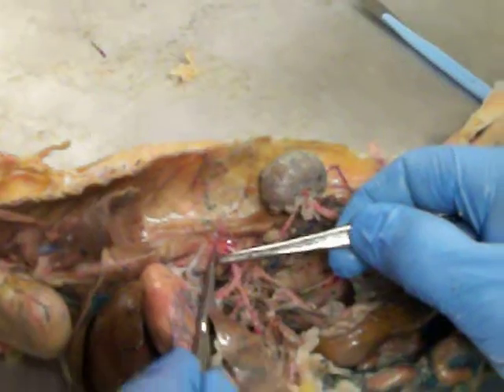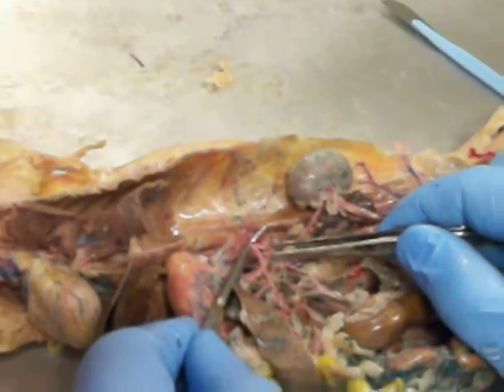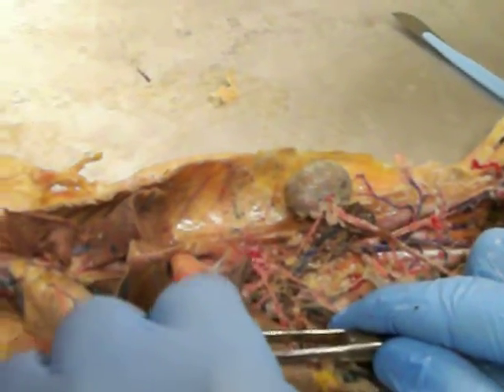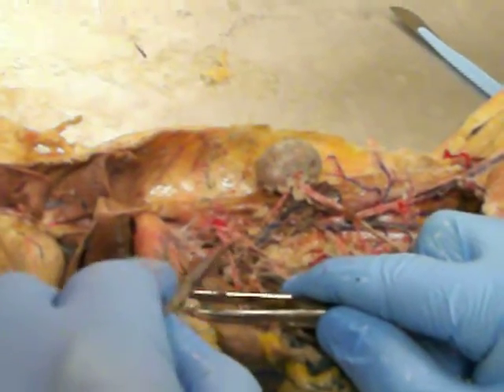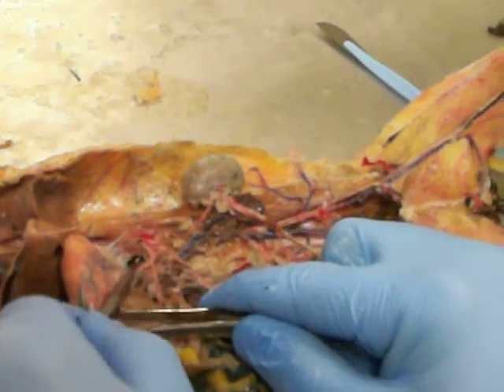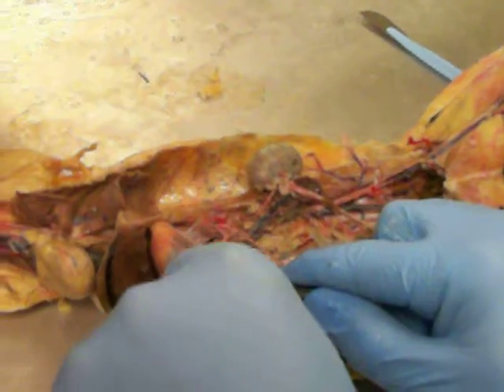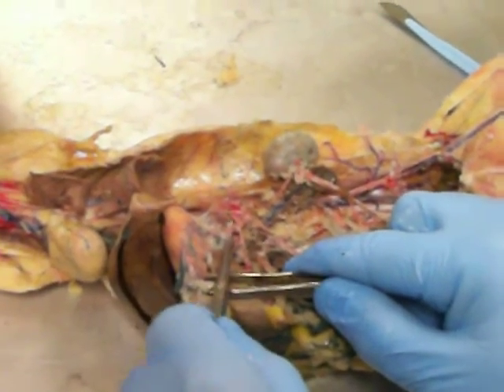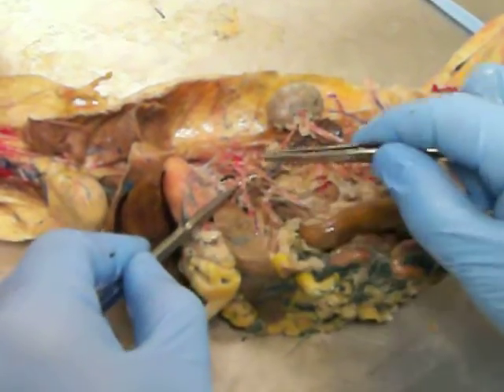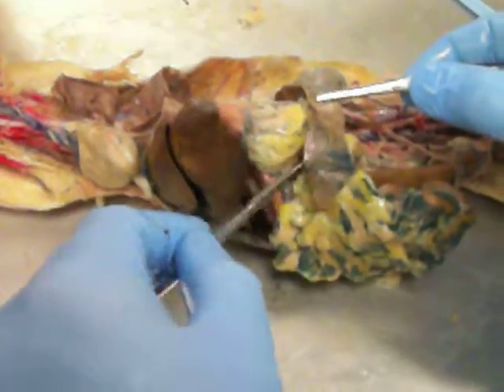It's going to branch. The first branch is called the celiac artery or the celiac trunk. Right there. Either one's right. The celiac trunk is going to branch into three branches. The first branch is the hepatic artery, which is kind of broken on this cat. First one's your hepatic artery. Second is gastric artery, which goes to the stomach. The third branch is the splenic artery. And then notice that the splenic may branch a few times, but it goes over here to the spleen. See how small that spleen is?